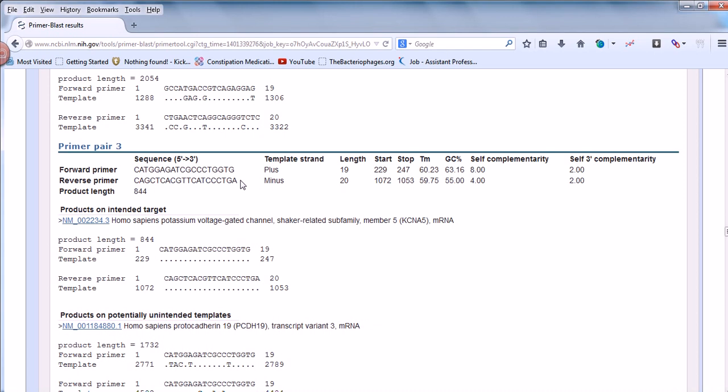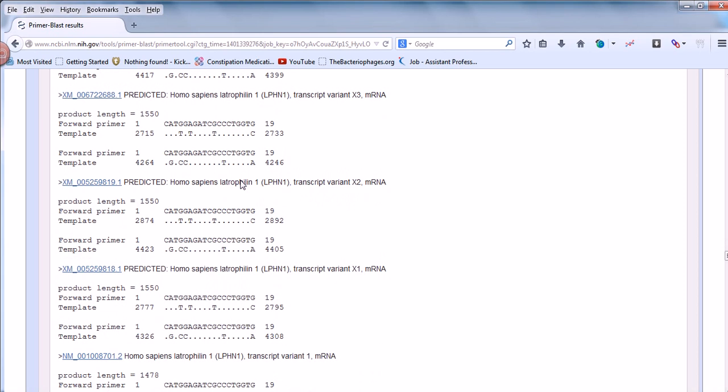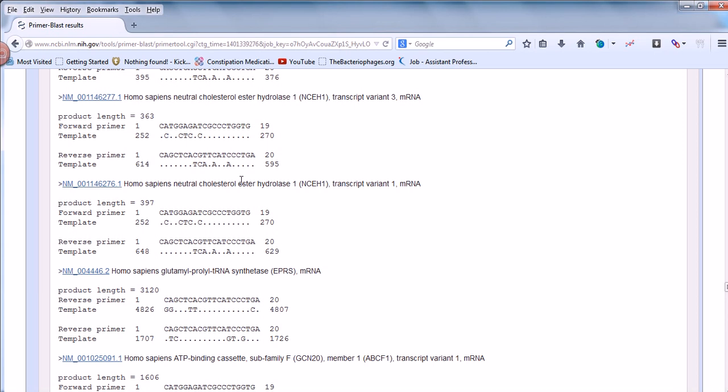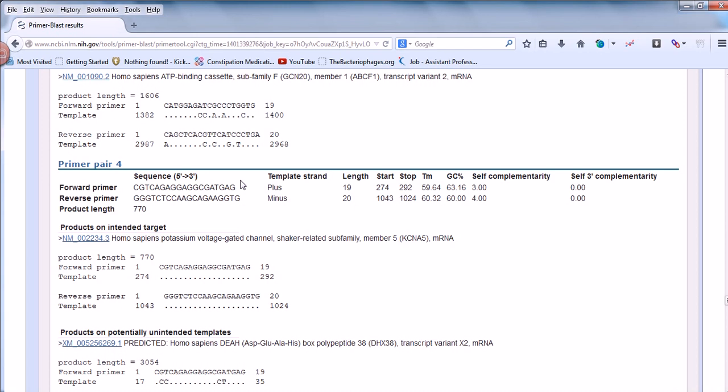That's how you need to check for compatibility, whether your primer is going to work exactly in your media or in vitro conditions using that SMS or Sequence Manipulation Suite. Once you get it, that will be fine. So check it. We also have two left, but I'm not doing that for you because the same procedure will be repeated. Among the three pairs of primers, the third pair stood out to be good, so you need to take that one.